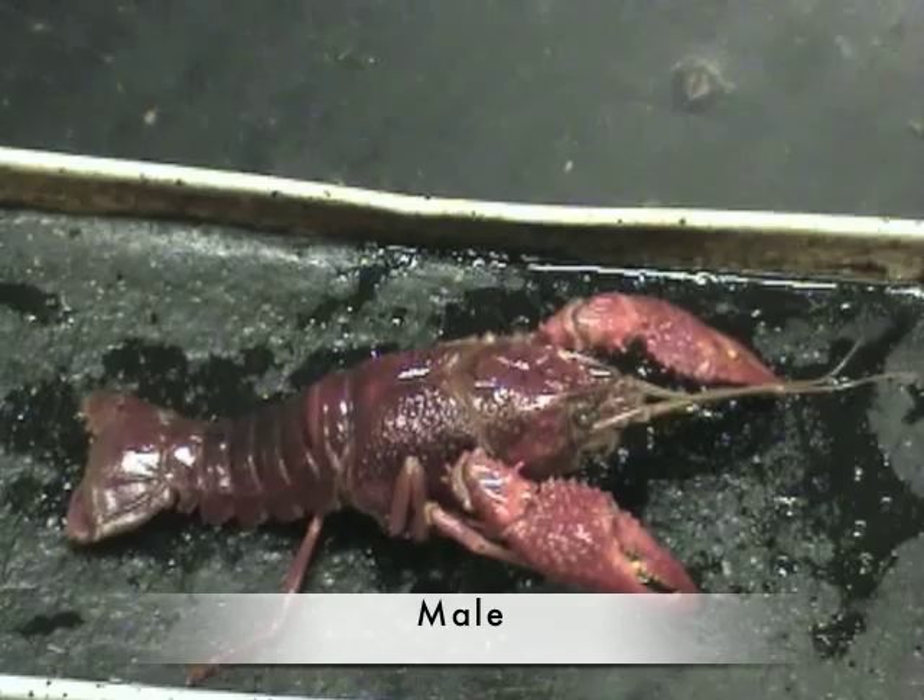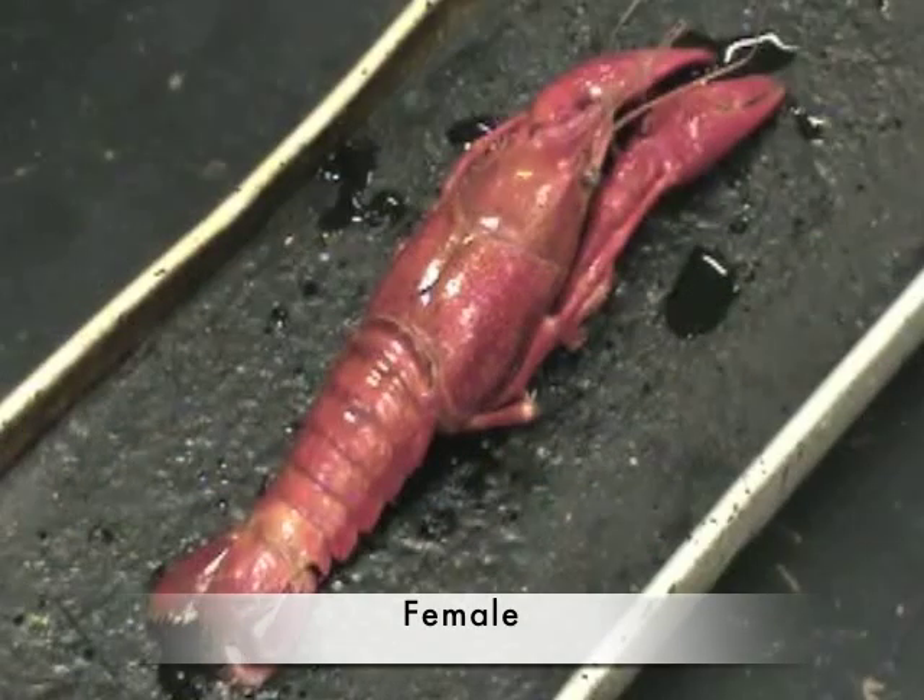Observe the specimen's external features and identify the sex of your crayfish.